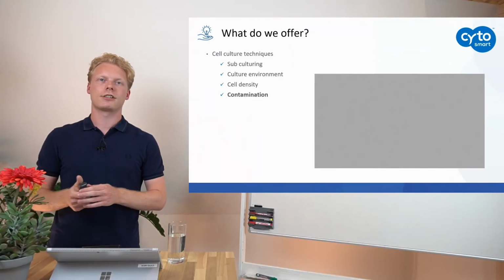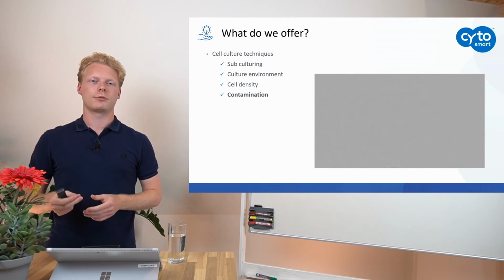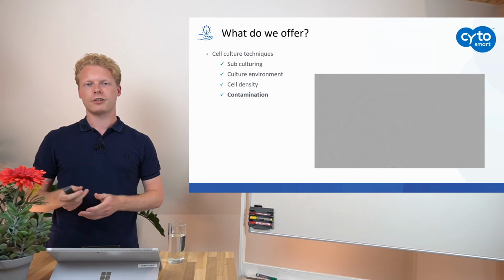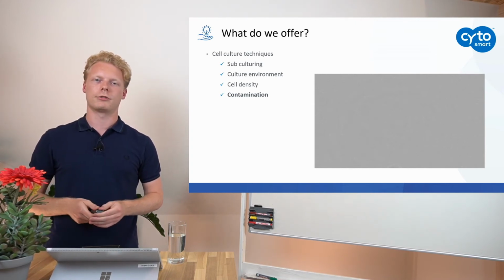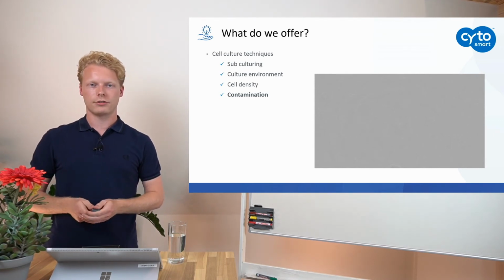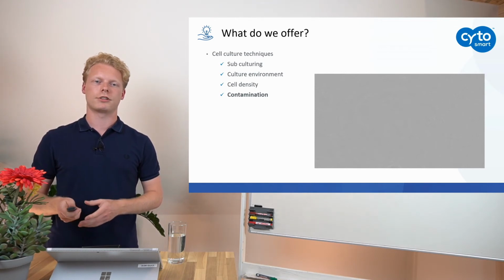So these are just some examples of how the Lux2 can really improve cell culture techniques, and in this way students will also have more confidence when they are working in the lab. And this also leads to more motivated students, and eventually a better engagement of students. But next to that, the Lux2 can also contribute to the way in which students understand dynamic processes.